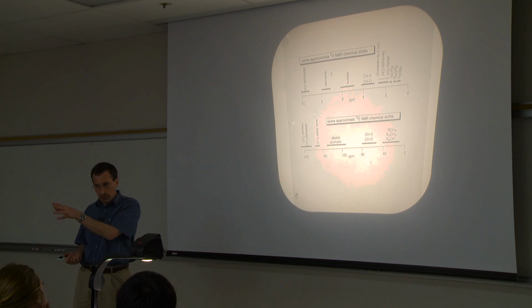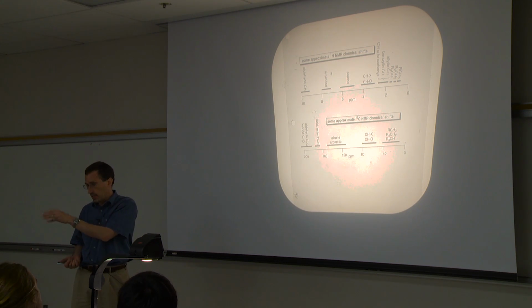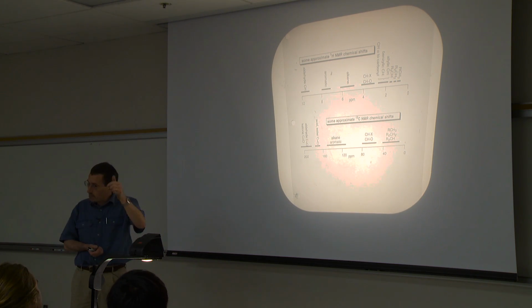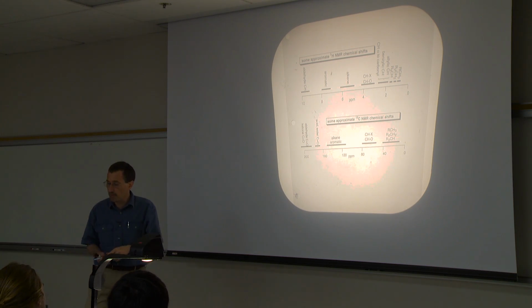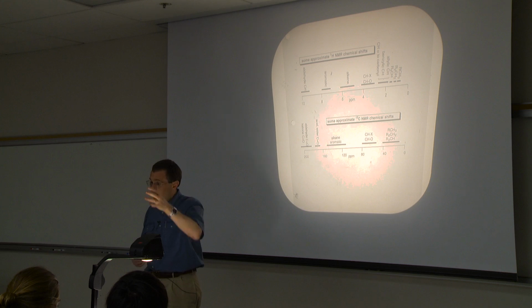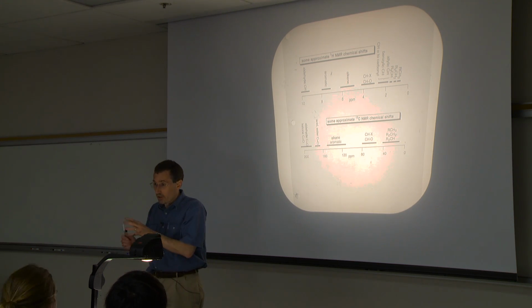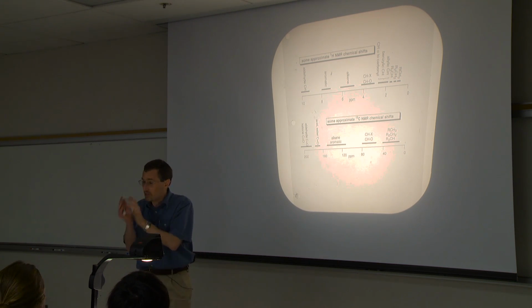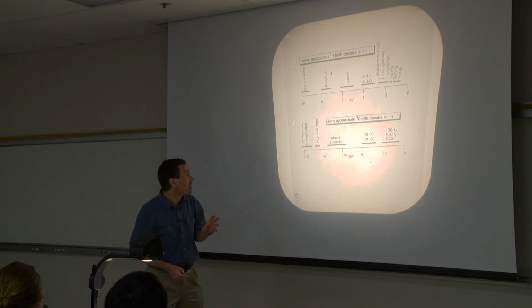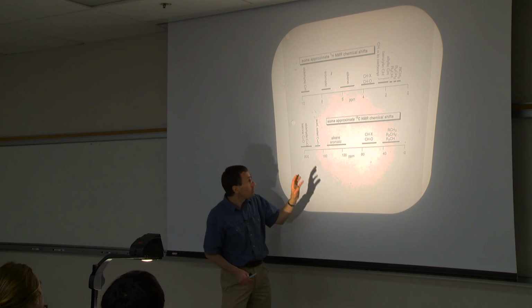A carbonyl next to a double bond or a benzene might be at 1680. A carbonyl that's part of, say, a lactone ring, depending on the size of the ring, might be at 1775. And you'd still say, oh, it's a carbonyl, so it's not carved in stone. Oh, a carbonyl is 1700 or 1720. But yeah, if you read that way, it's pretty reliable.